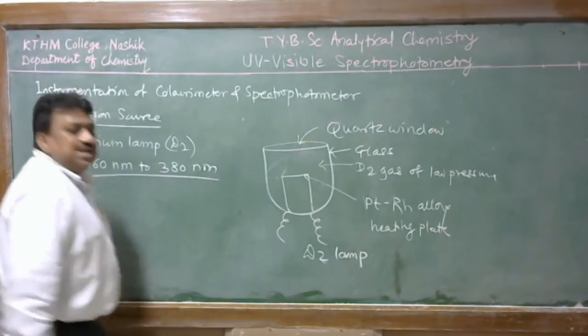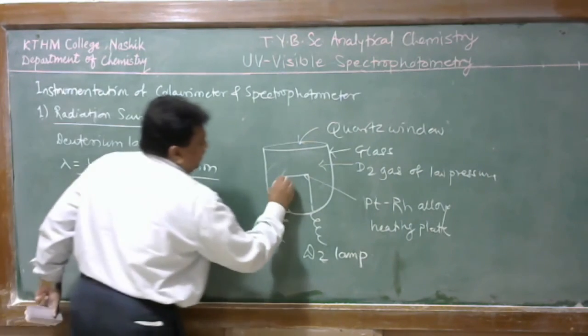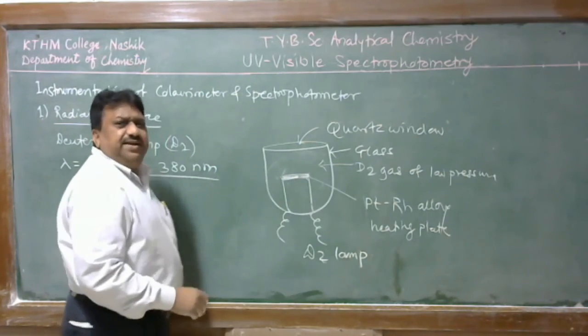And how is this wavelength generated? In this case, the filament is electrically heated.